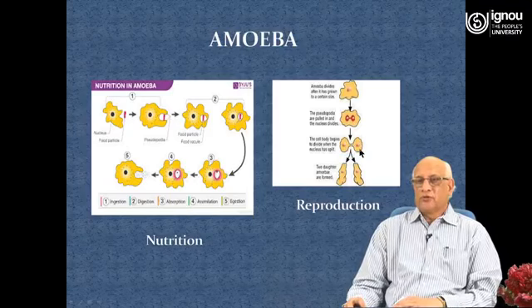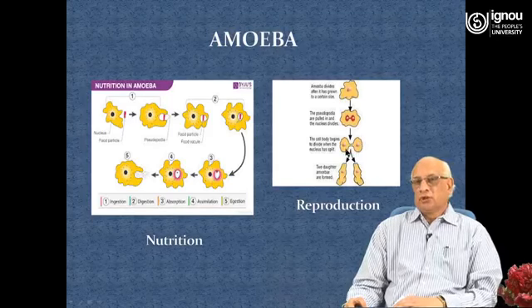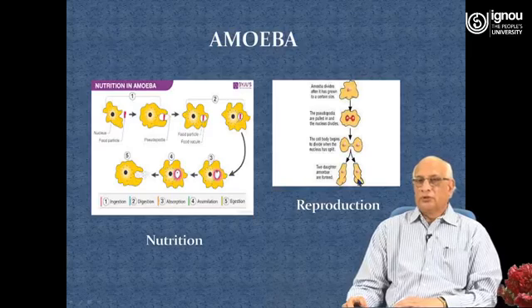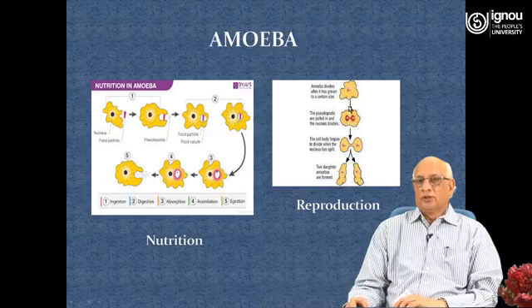The two daughter cells are formed, and each daughter cell is of a smaller size. When the food vacuole and the pseudopodia are formed, these two daughter cells are converted into amoebae. So this is how they reproduce, which is known as binary fission, and binary fission is always in favorable conditions. So we have studied these 4 slides. Number 1 was paramecium, number 2 was euglena, number 3 was amoeba, and the 4th one was showing the stages of reproduction, binary fission.